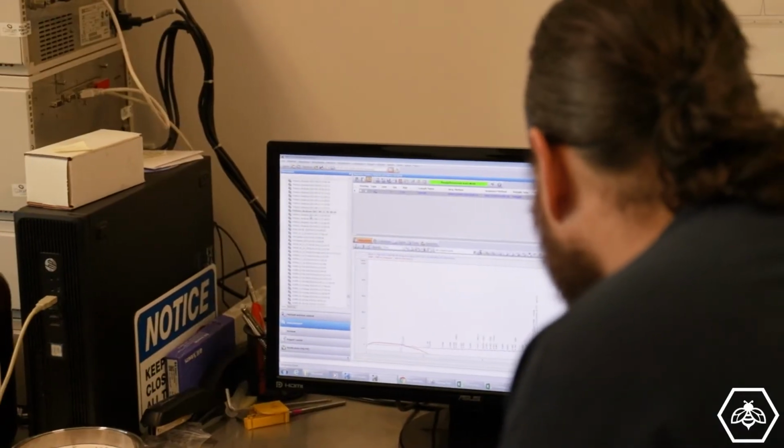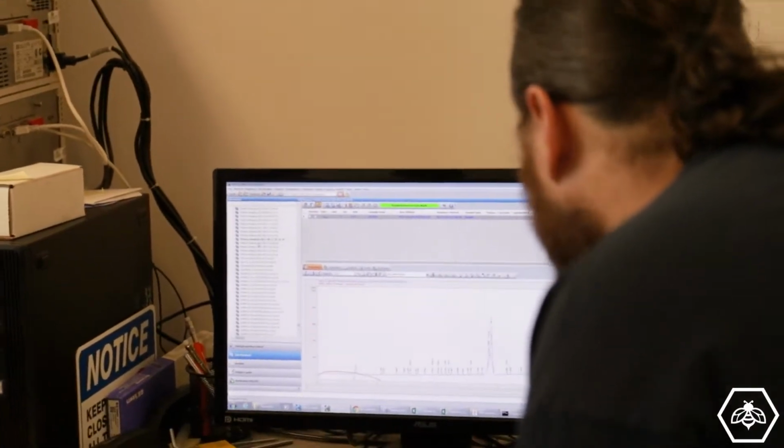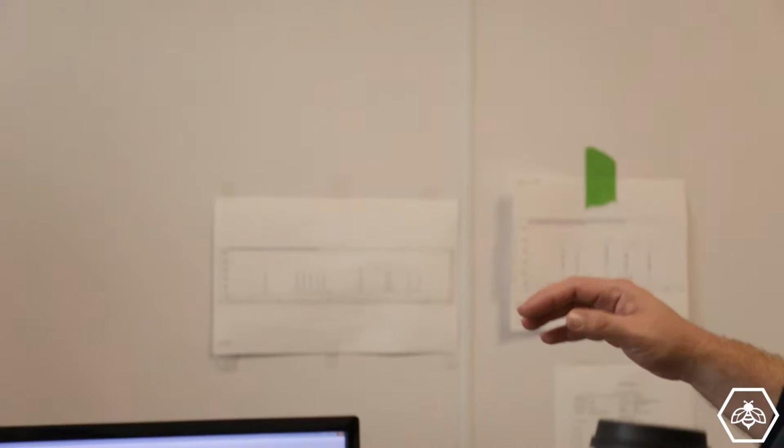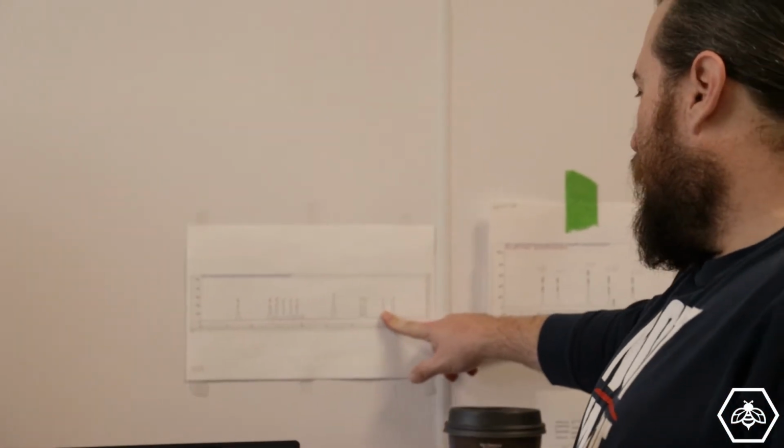And then this one is a little stronger shot. That's just a shot of a larger sample load. CBN is always going to be a bigger peak, but it can be the same percentage. It just reacts to the light differently. It's got a different response factor, and that has to do with its molecular weight and all kinds of stuff like that. And since cannabinoids are all almost the same molecular weight, that's why they all come out different.